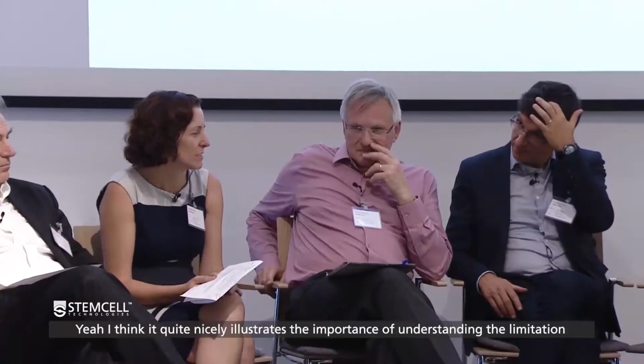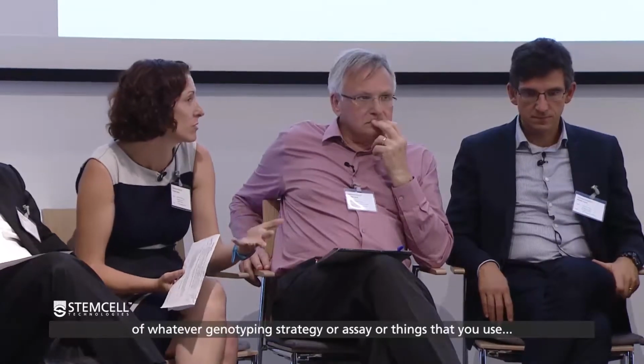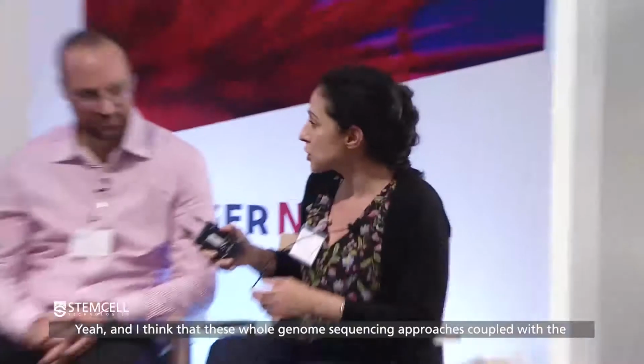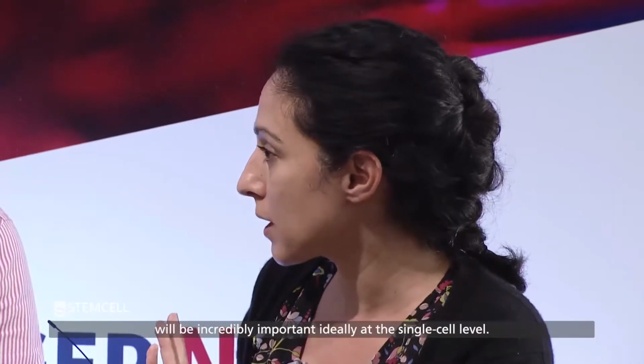Yeah, I think it quite nicely illustrates the importance of understanding the limitation of whatever genotyping strategy or assay you use and what it might actually possibly be telling you. Yeah, and that's where I think that these whole genome sequencing approaches coupled with the CRISPR-Cas9 technology in a clinical context will be incredibly important, ideally at the single cell level.